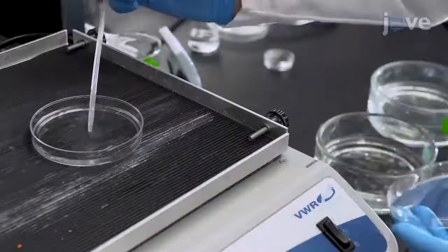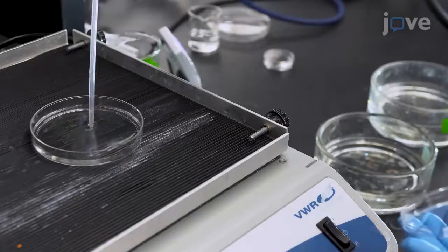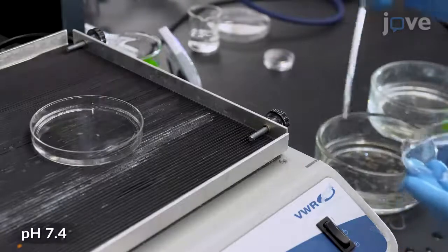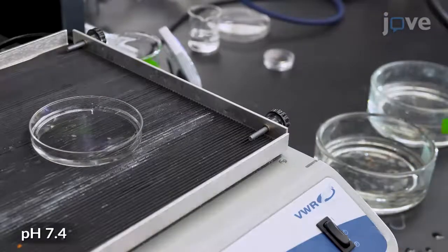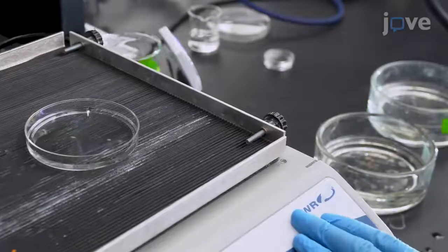After fertilization, to de-jelly the egg packages, place them in seawater containing 3% cysteine on a glass petri dish and gently agitate on a shaker for 12 minutes.